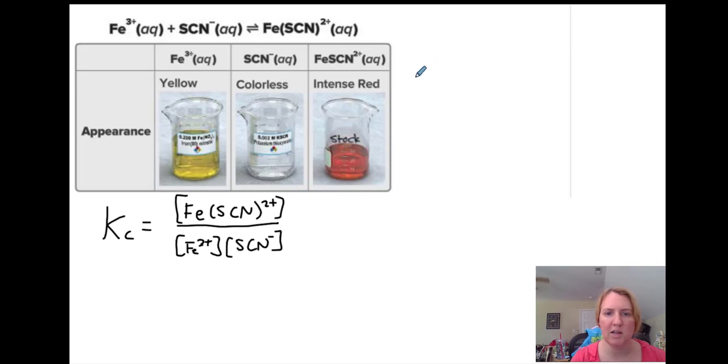So Beer's law is the absorption is equal to the absorptivity constant times the path length times C, where A is the absorption, that is what's measured from the spectrophotometer. C is your concentration. So in the first experiment, we know what the concentrations are because we're making the curve.